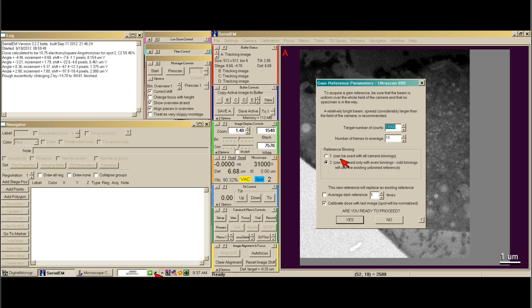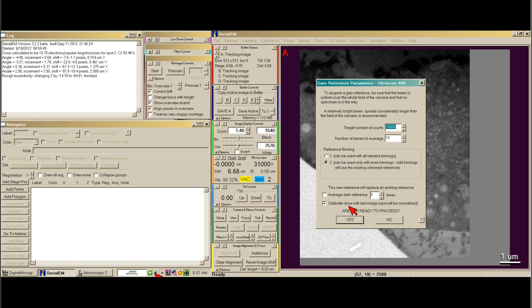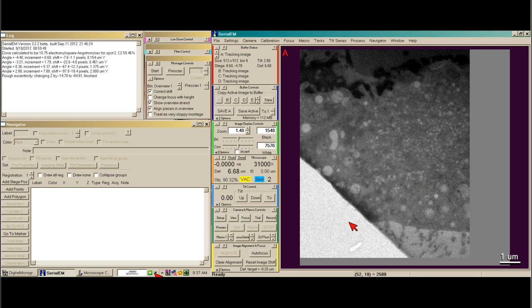However, if you know you're binned by 1, you should use reference binning 1. And then we always calibrate the dose with my last image so that it's perfect for using for cryo. So we say yes.